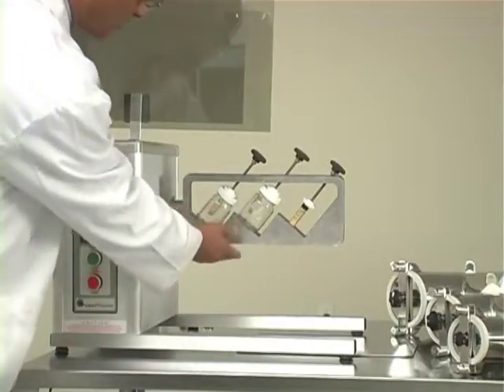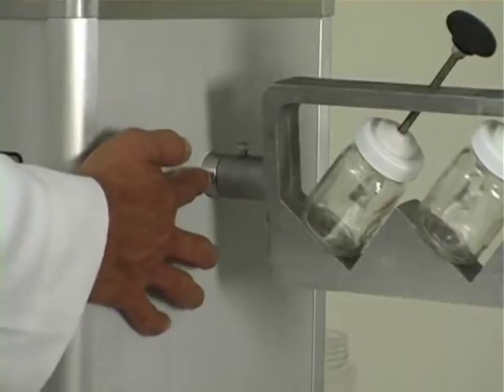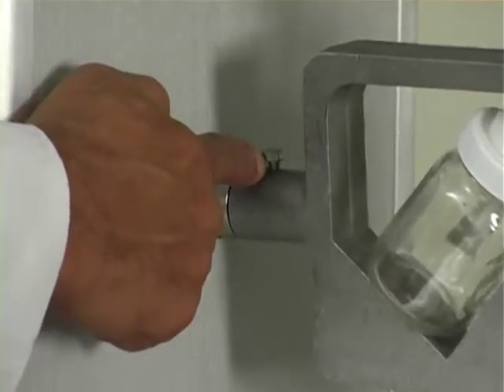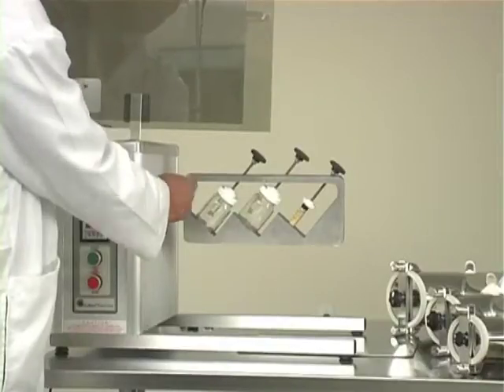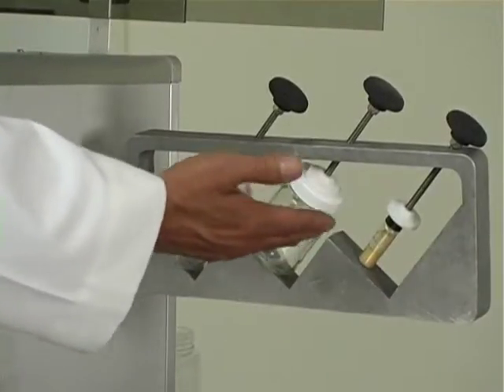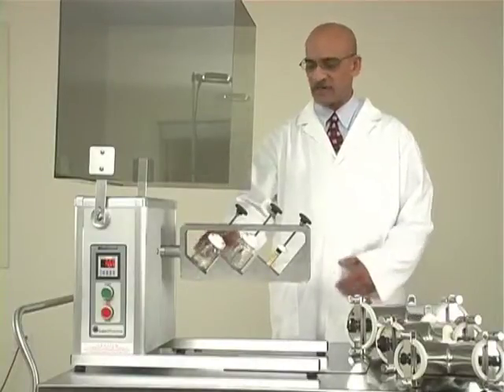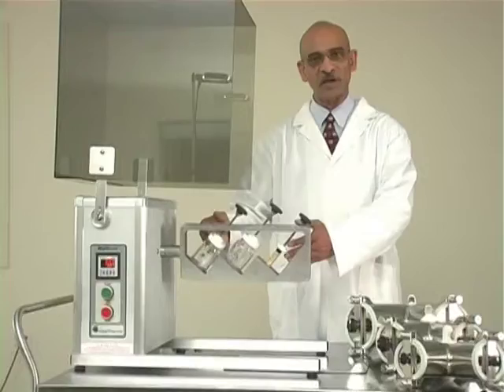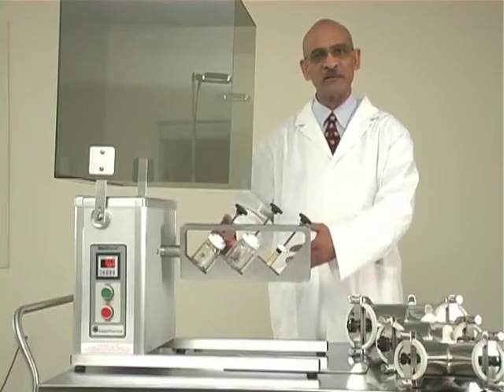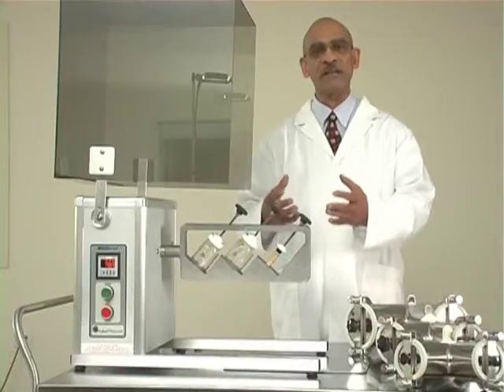This is the bottle blending attachment, which is attached to the drive shaft by means of a small bolt here. The bottle blending attachment has three bottles or vials. Let me take one bottle out and I will put microcrystalline cellulose powder in it with a little bit of color, and then we will mix it. You can see after the mixing is finished how the blend looks.